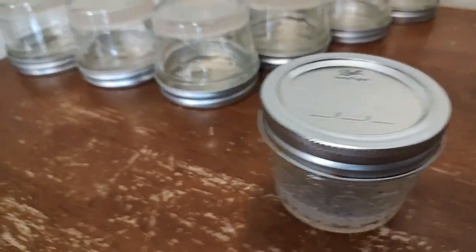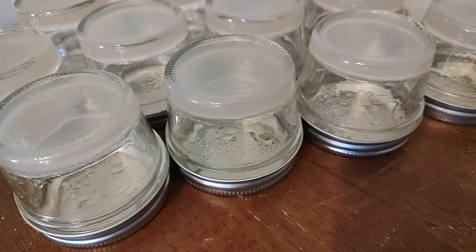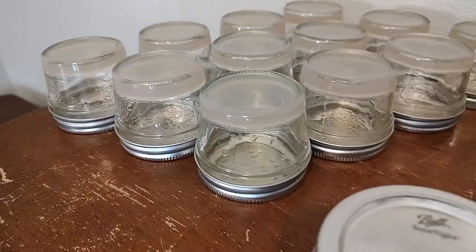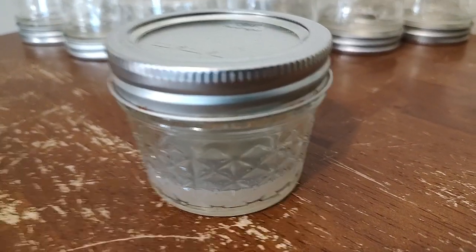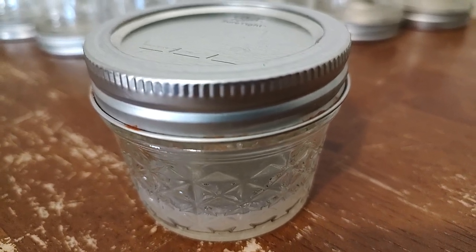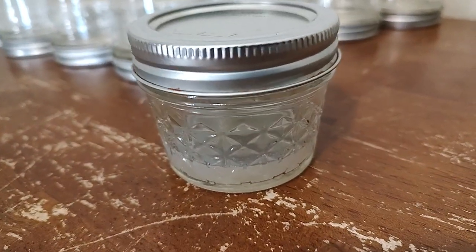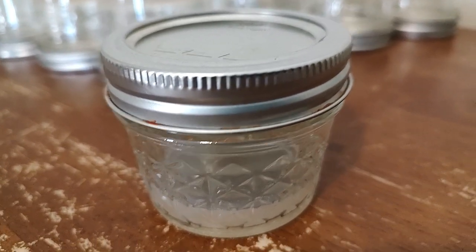It is always our intention here at Mycology Exploration to simply share what works for us. We all live in different parts of the world, and the weather, humidity, and moisture is different where all of us live. It also depends on the temperature and the environment where you're actually growing mushrooms — all of that matters when you're talking about fungus, mycology, and growing mushrooms, whether gourmet or medicinal. We have used these techniques for all types of mushrooms.